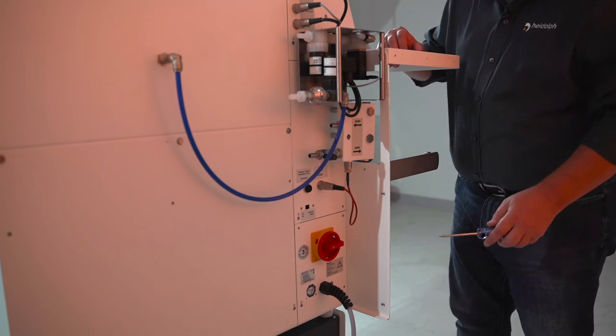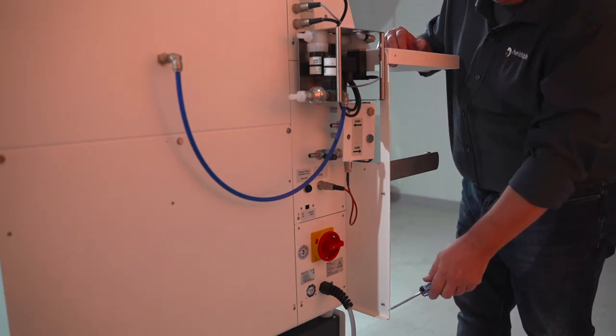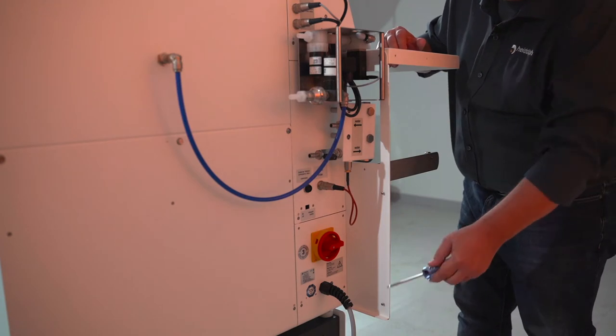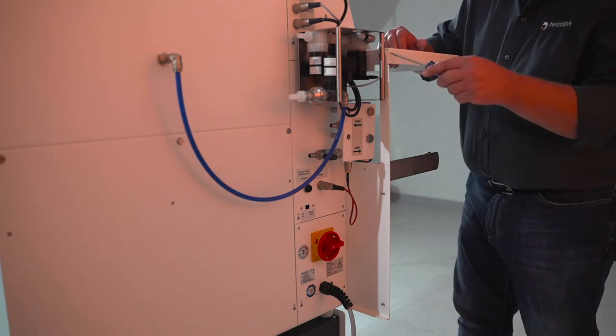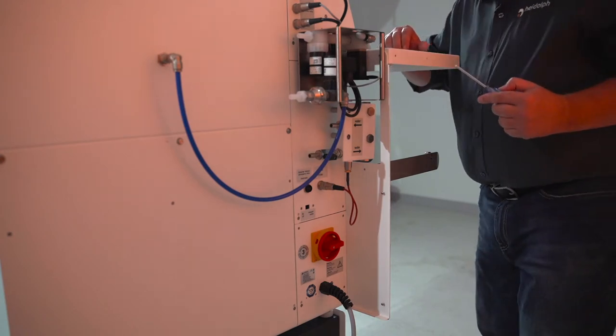After you remove those five screws on the side, you're going to want to come around to the back of the unit. There are three screws here that we need to remove: one on the bottom, one on the middle, and then one on the top here in between the manifold in the back.